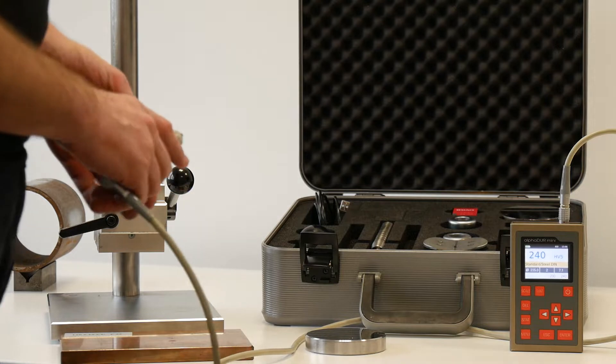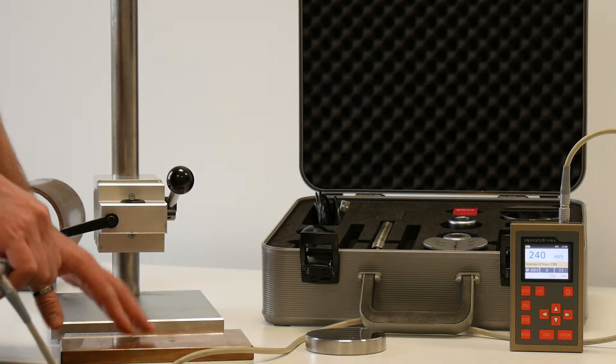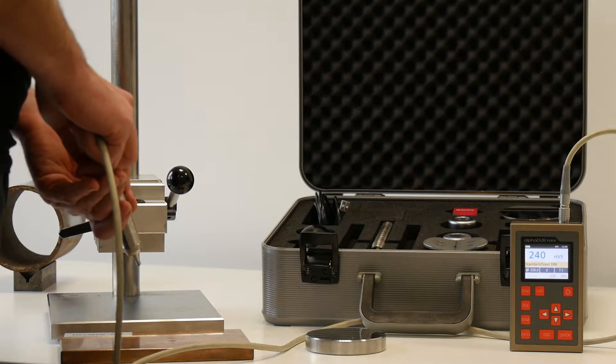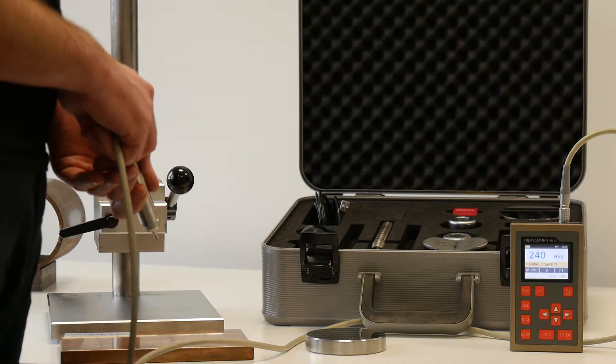If you want to make measurements on other samples, like on this copper plate, its hardness is approximately 85 Vickers, then you will need to make a material calibration.